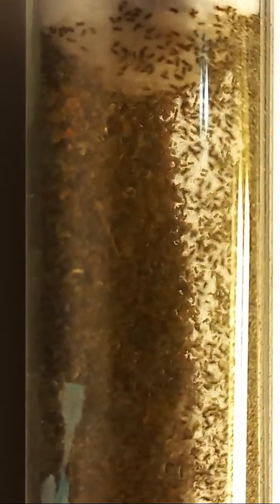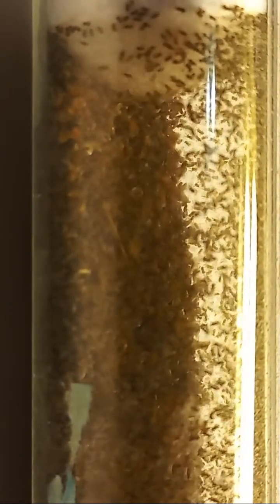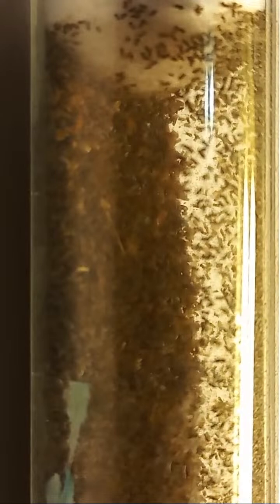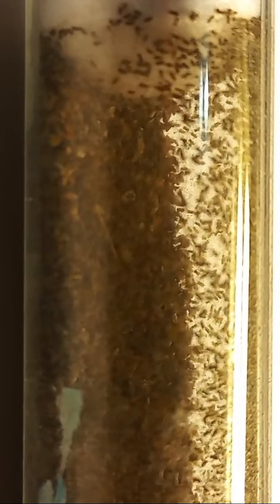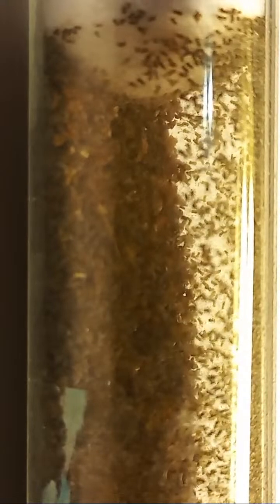The host is grain moth. Grain moth, just very tiny, which is feeding on a grain of wheat, for instance, in the laboratory, and the Latin name is Sitotroga cerealella, a very common species. In Southeast Asia, different species can be used as well for laboratory study, for laboratory breeding.